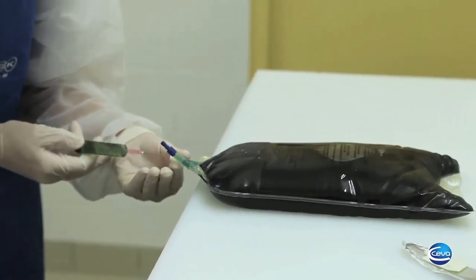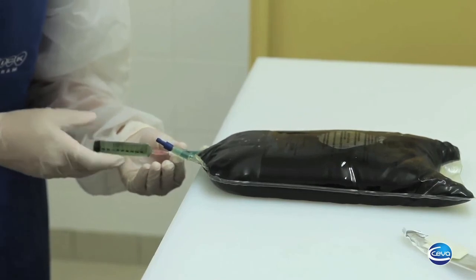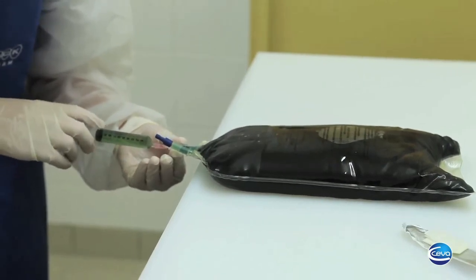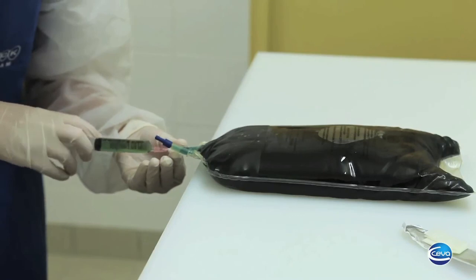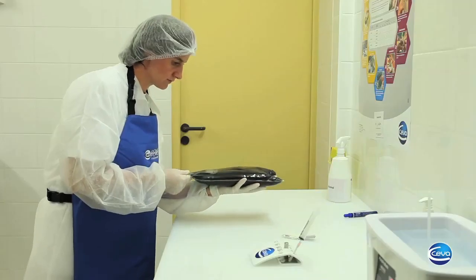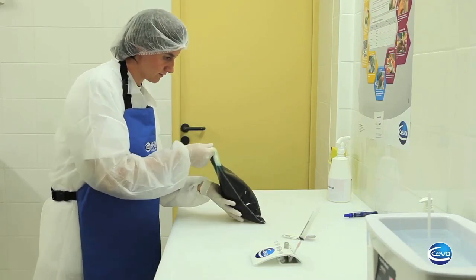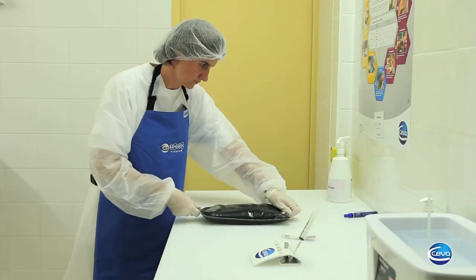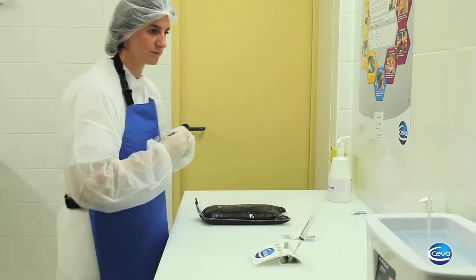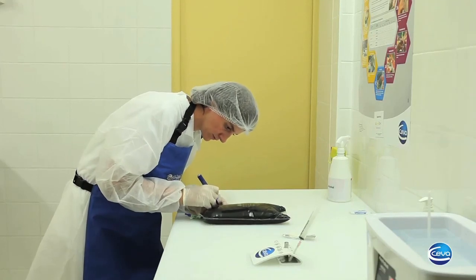Gently insert the vaccine into the diluents bag. Shake the bag gently to homogenize the vaccine. Mark the bag with the time of the end of the preparation.